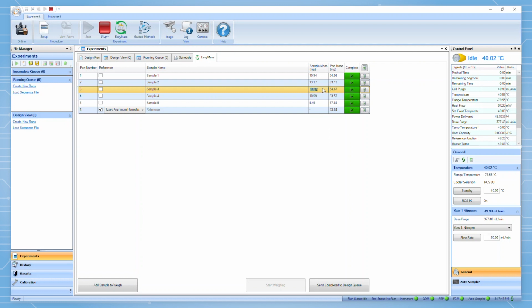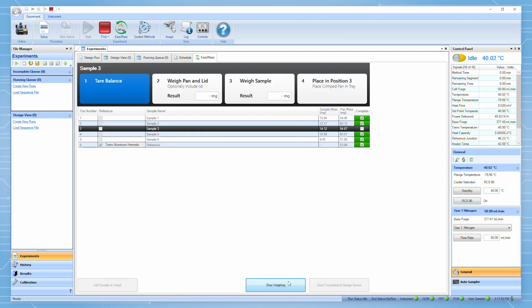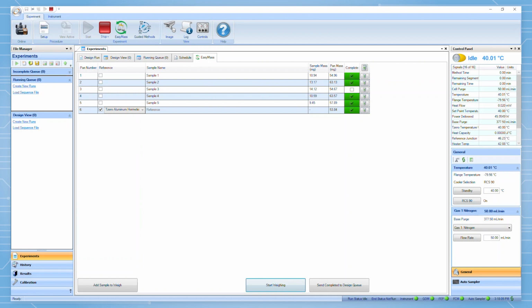Each entry you just weighed is now marked complete. If there were any mistakes or you want to reweigh an entry, you can uncheck the complete box. Whenever Start Weighing is clicked, any entry not checked complete will be sent to the balance for weighing. During weighing, you can disconnect from the balance by clicking Stop Weighing, and any values already captured will be saved. You can reconnect to the balance and finish incomplete entries anytime.